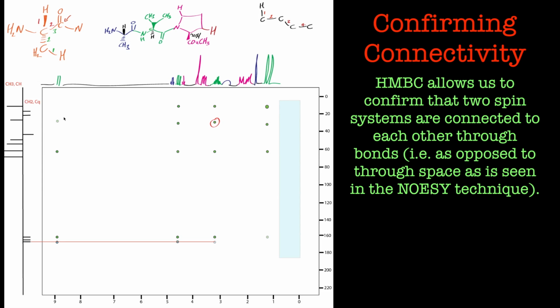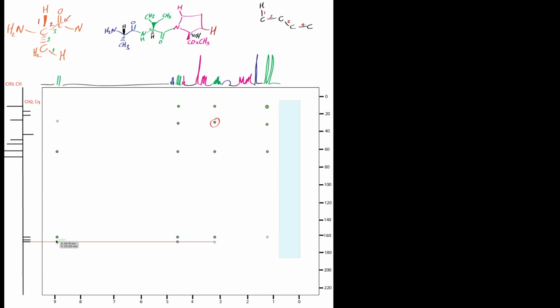We've just got the NH proton actually. We're going to say that's it, but we've got the NH proton, so we have a look at the NH proton and we'll be able to get the carbonyl quite strong. It's just a 2-bond correlation to that carbonyl, so if you can see that, that's really good. And also you're now able to detect carbons from a proton that's not connected to a carbon, so that's incredibly useful as well.